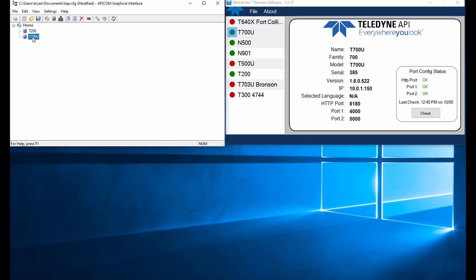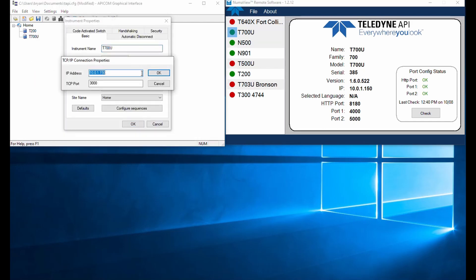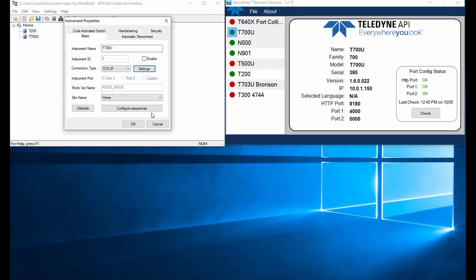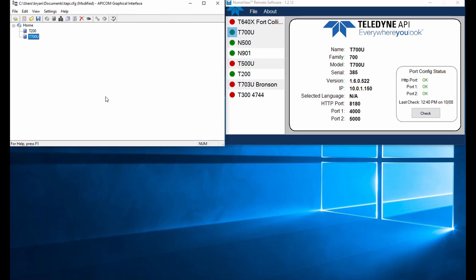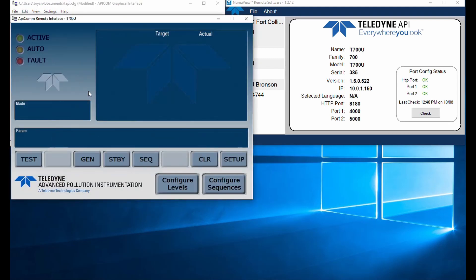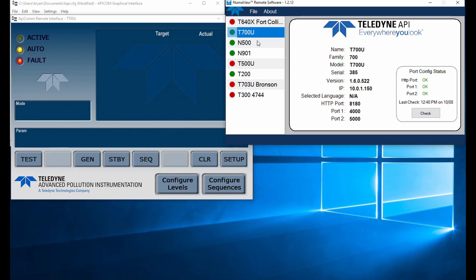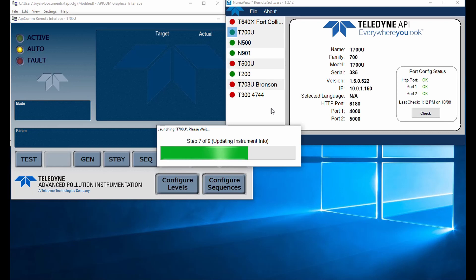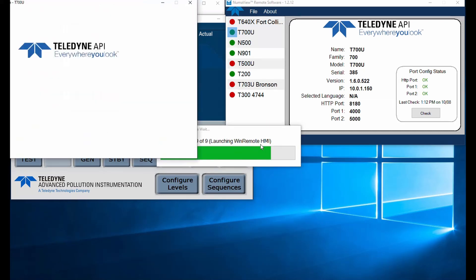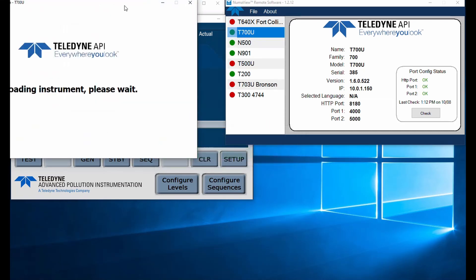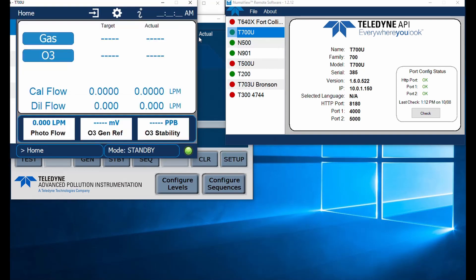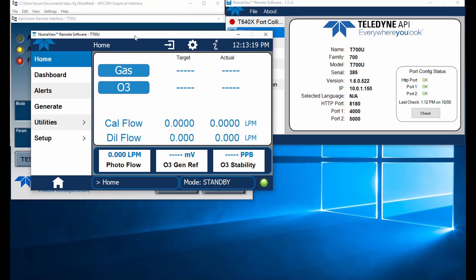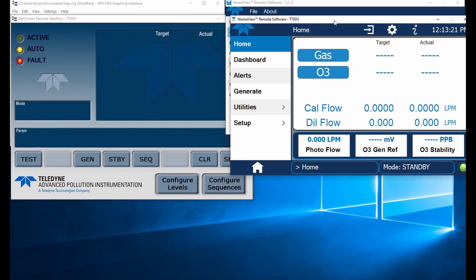These are the default ports for that. When we go over onto our Apicom, I've also set that up as an Ethernet device, same IP. It's using port 3000. So those ports are all available on the instrument. So let's go ahead and bring up this remote interface. The first thing you're going to see is there's really no way to interact with that Numaview instrument over our Apicom. Let's now bring up the interface for Numaview remote.